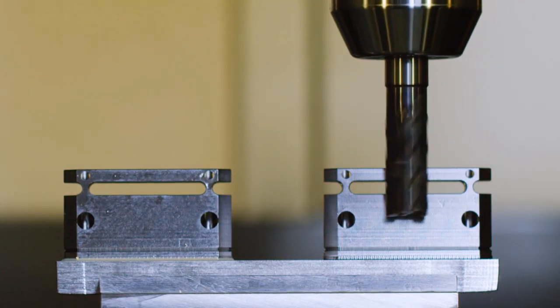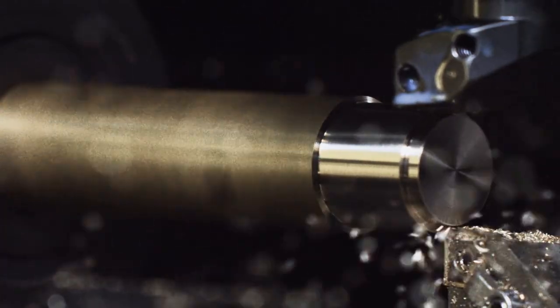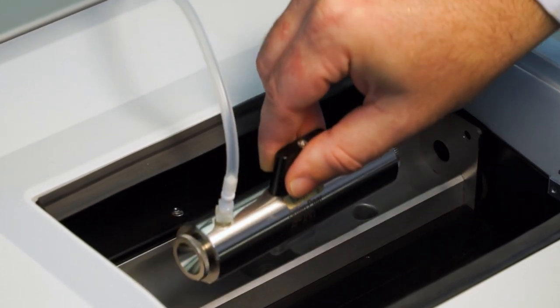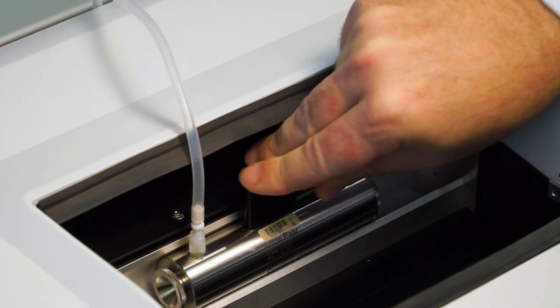MCP components are designed and machined to perform and endure. Since the MCP's optical bench is machined out of one solid block of aluminum and fixed on flexible mounts, it withstands vibrations and other external influences easily and delivers stable measurement values.